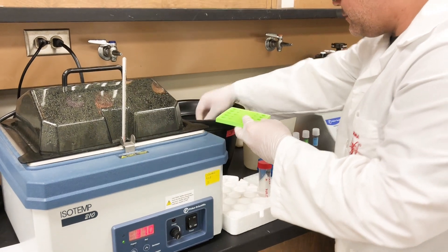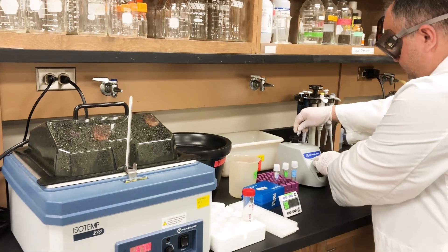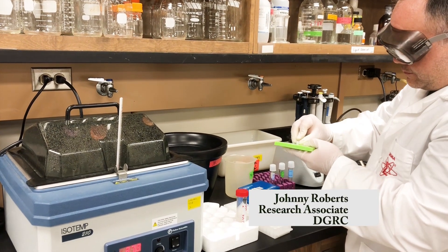Vortex the competent cells and disk mixture halfway through the ice incubation step and once more before heat shock.